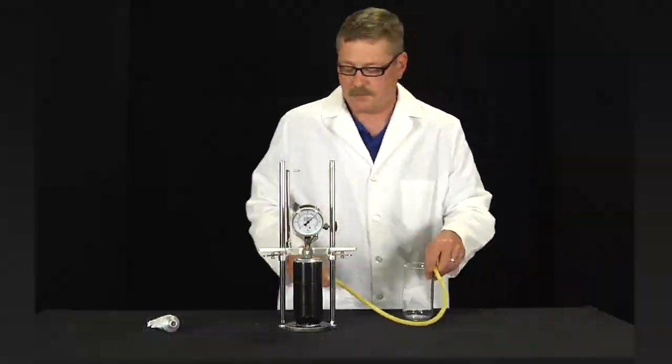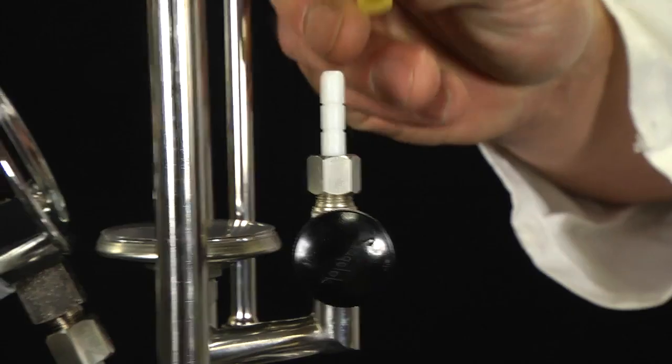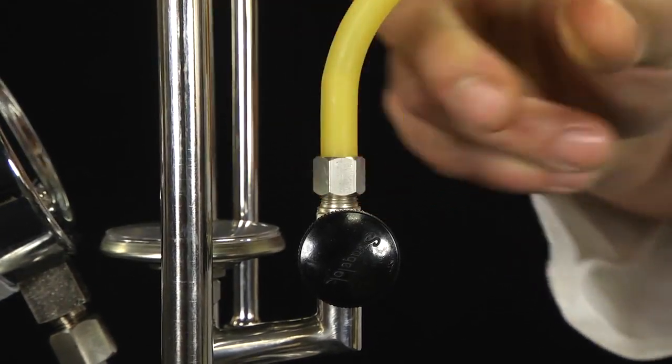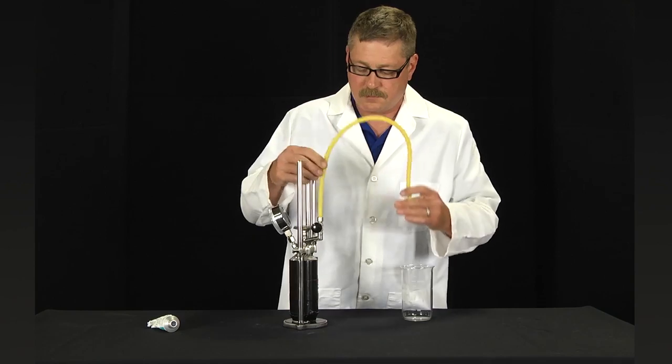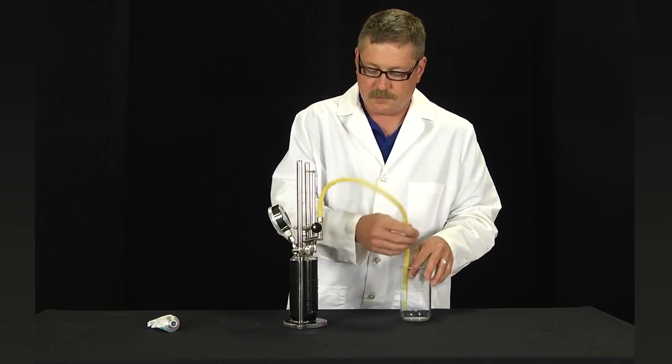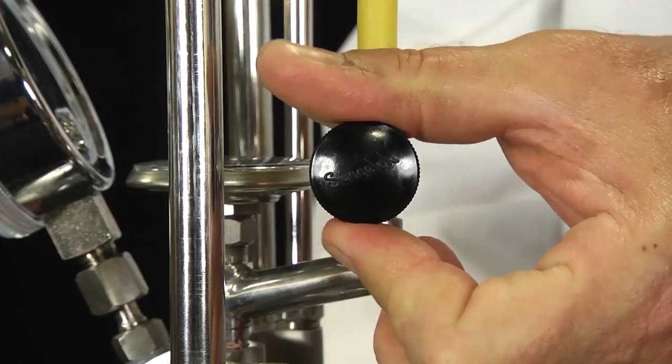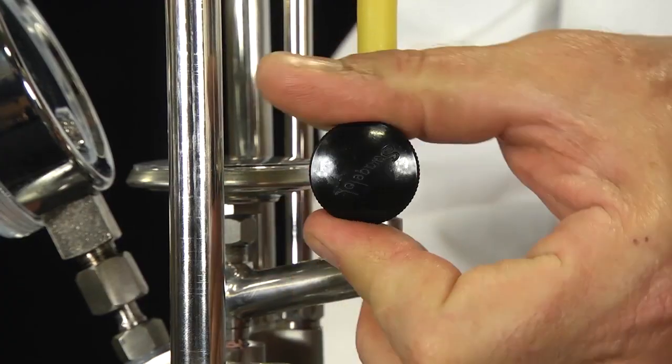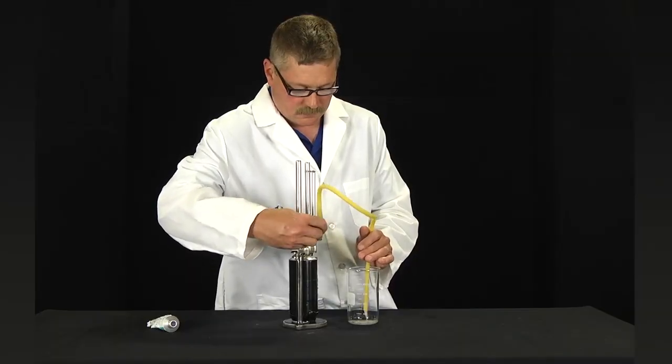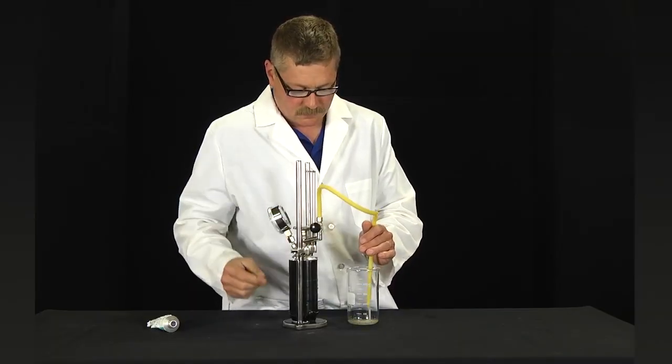After the test has been completed, attach a piece of plastic tubing to the hose nipple of the Whitey valve. Slowly open the Whitey valve to bleed off the pressure in the container and drain into a sink or suitable container.